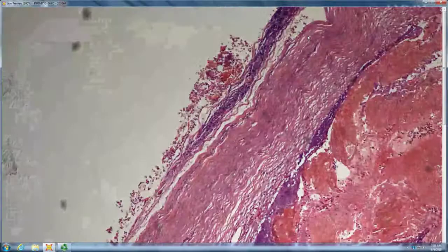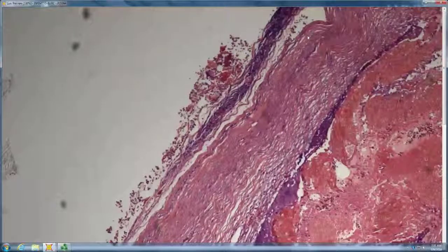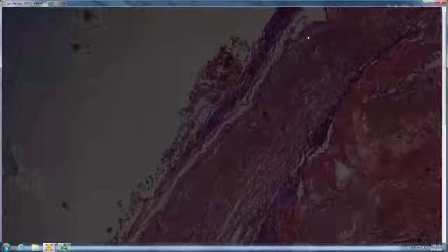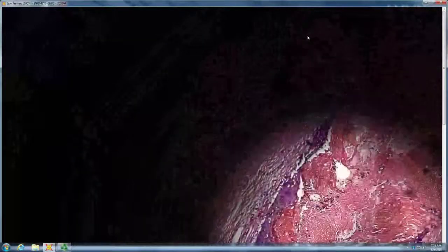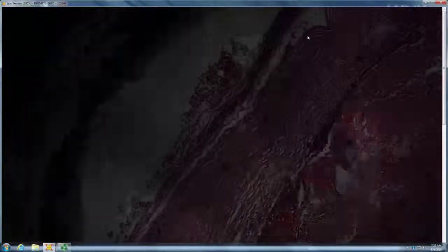One of the things you should do is, first off, the bottom aperture should be open all the way, otherwise things never look in focus. And then with your condenser flipped up, close your lower aperture, and then you've got to crank your condenser until your light source, if you look there, looks like a little stop sign. The way it was, like this, you would never be able to get into sharp focus. So your light source has to look like that. Okay, now everything will be in focus.